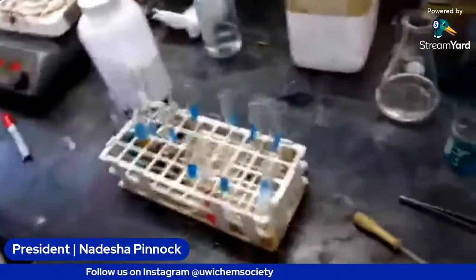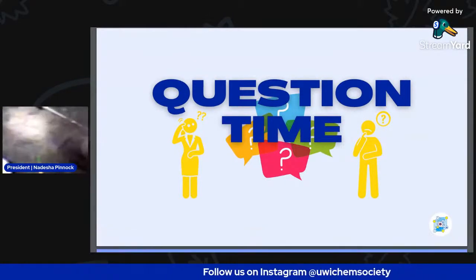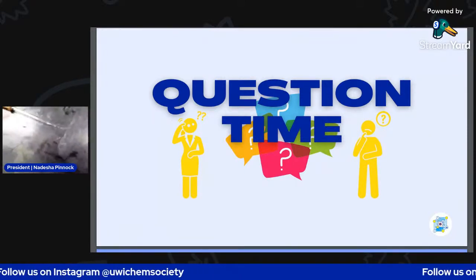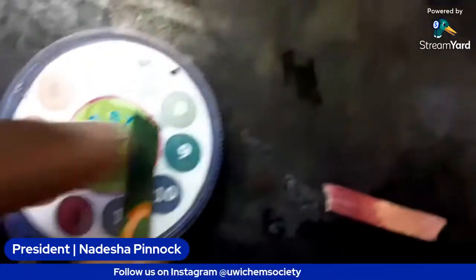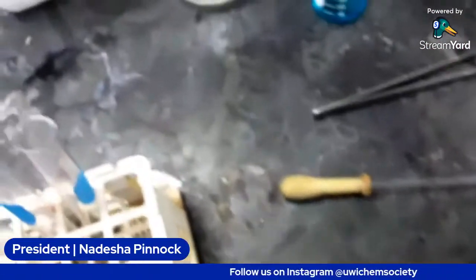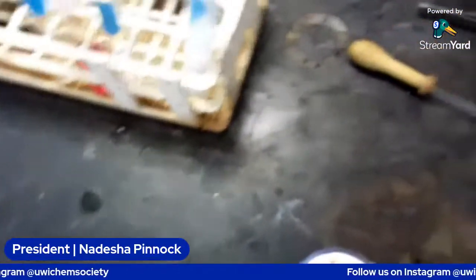So what we're doing now is making the sodium carbonate into a solution. See, it is an alkaline solution. You see that? So it's supposed to look like this. But I don't want one, so we're just going to make it into a solution. Add some more, and then pour it into this, and pray that they don't fizz anymore.